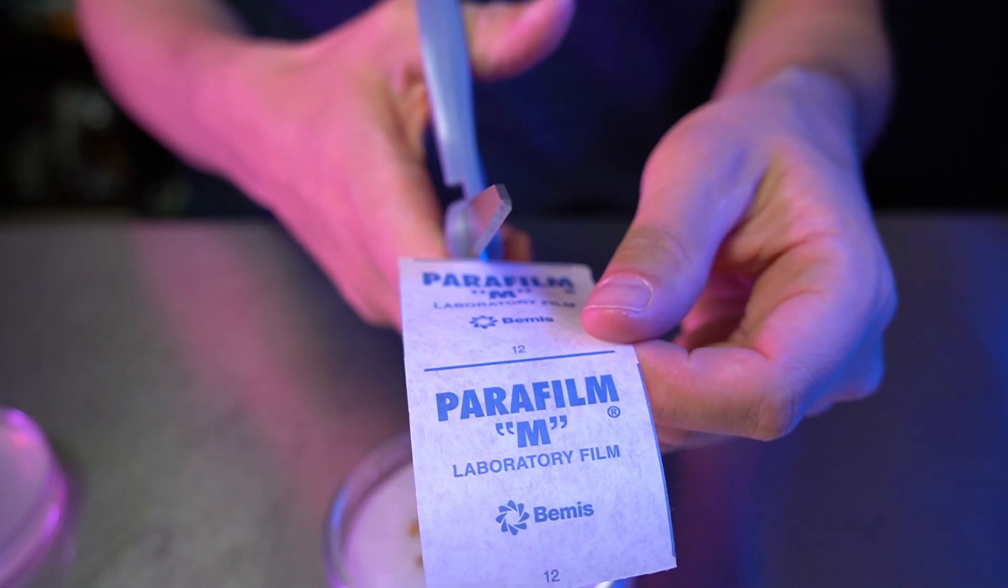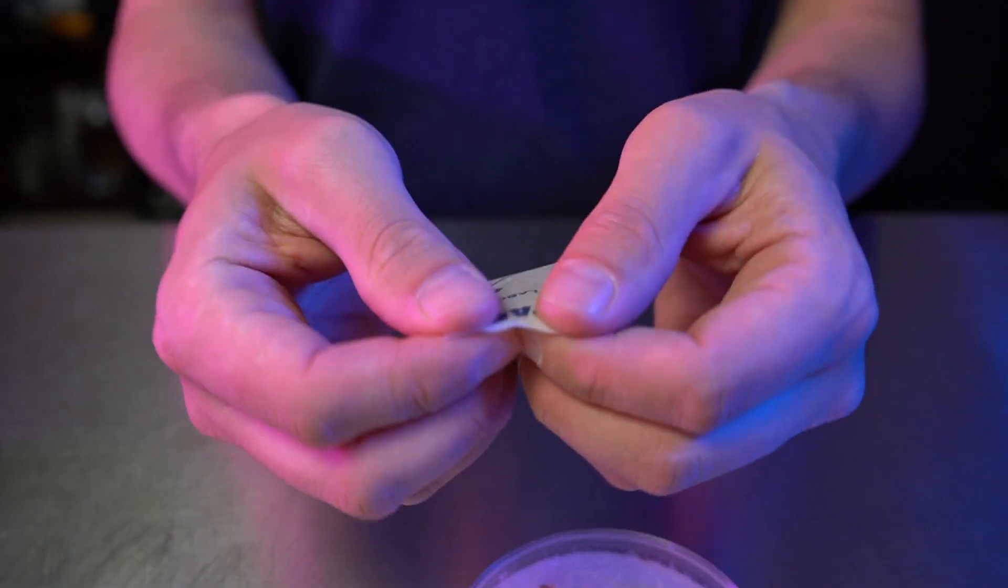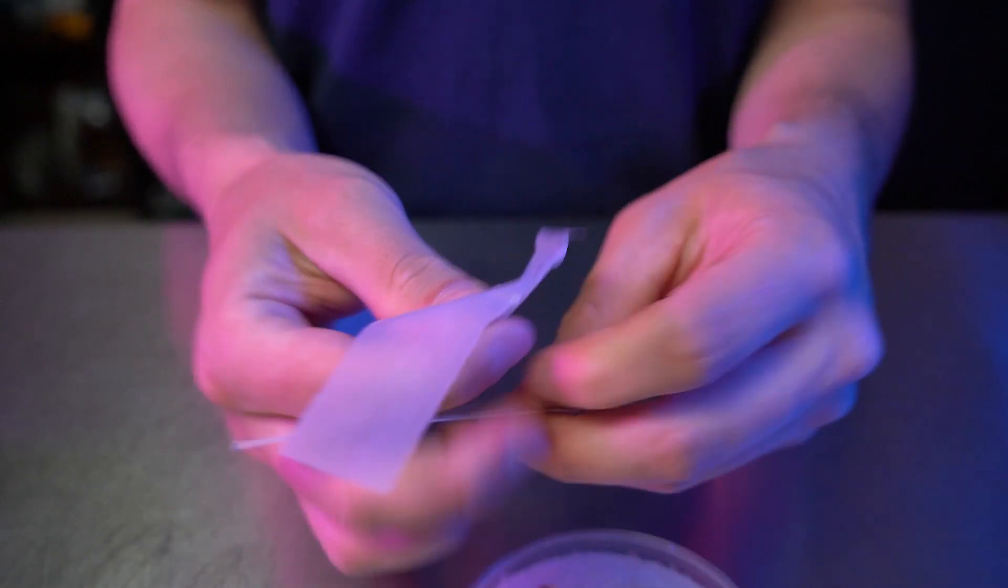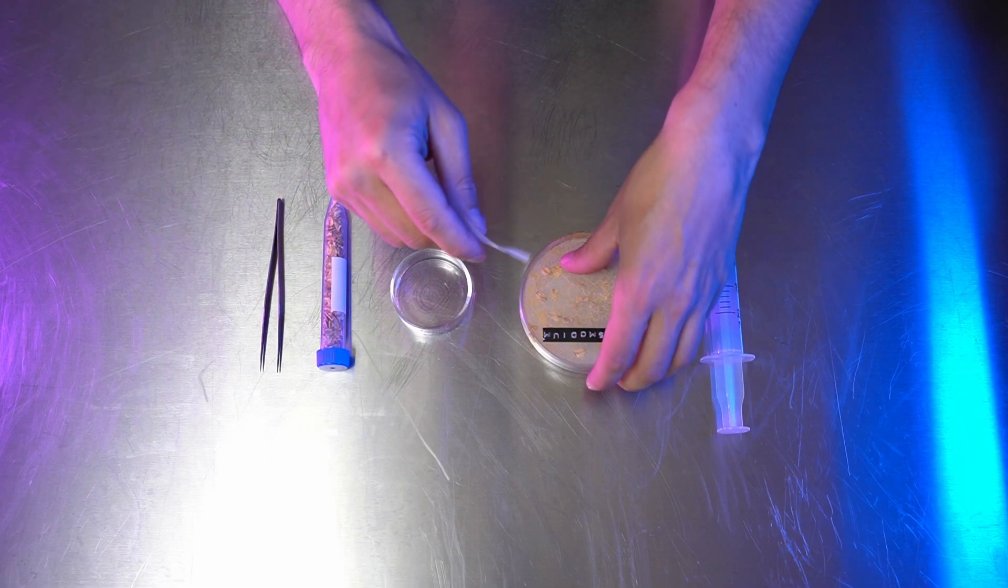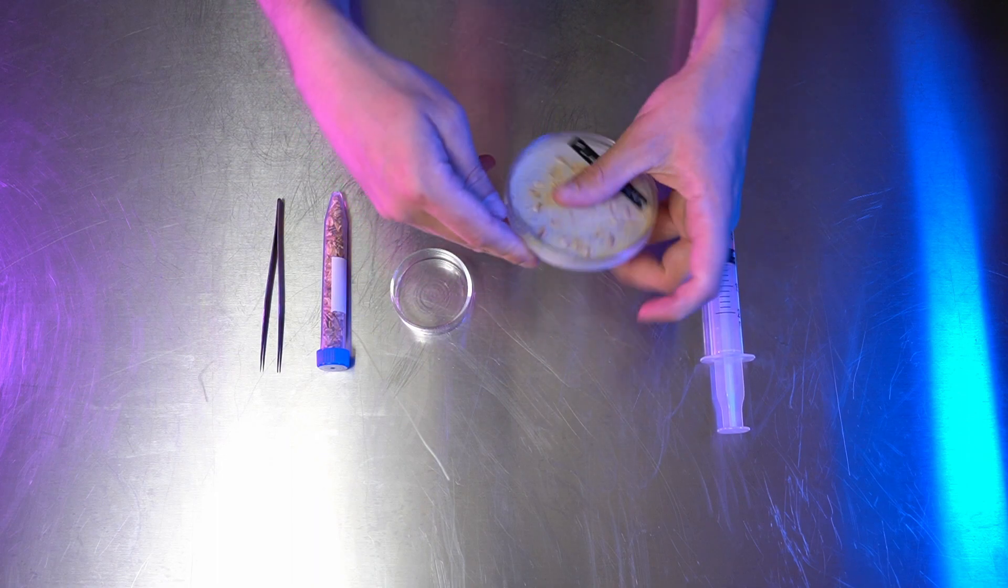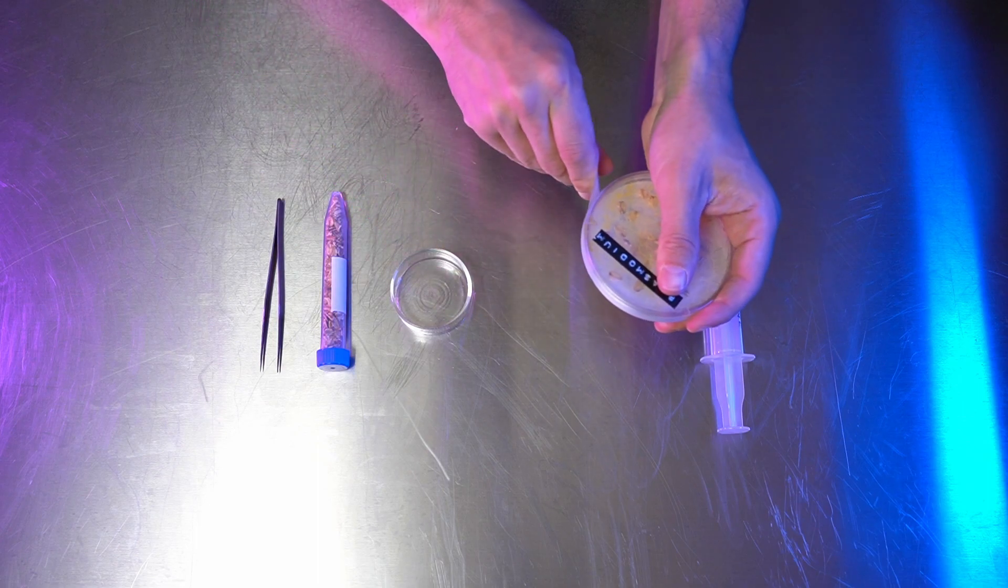You can seal up your dish with parafilm or cling wrap. Two squares of parafilm cut in half is plenty to wrap around a single dish. Hold one end of the parafilm down with one hand and stretch it as you wrap it around the edge of the plate. This will help keep your dish closed, keep out contamination, and allow air exchange.